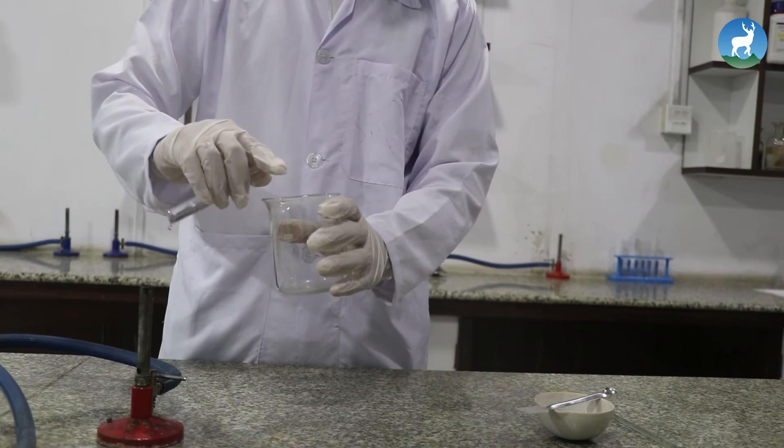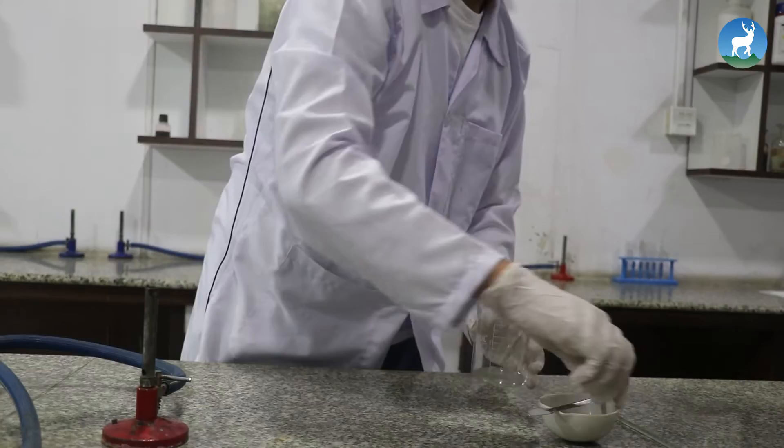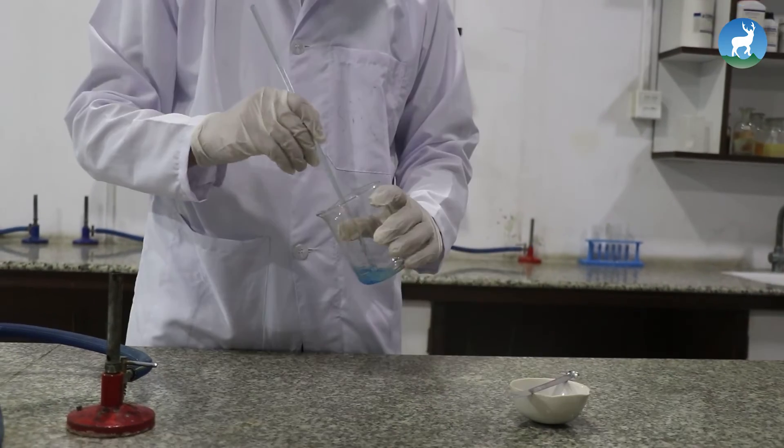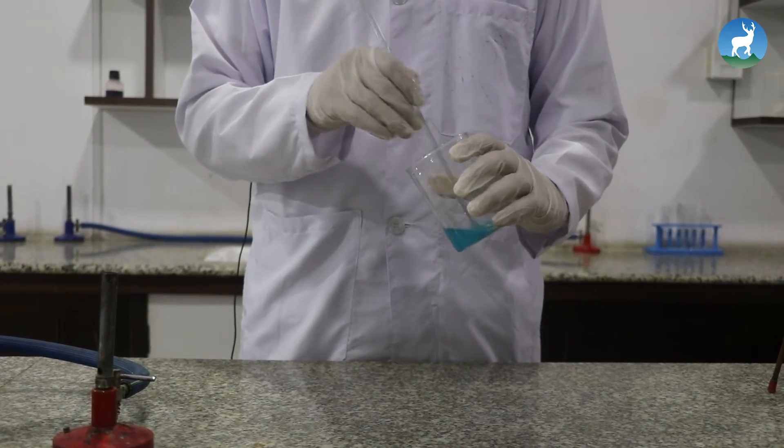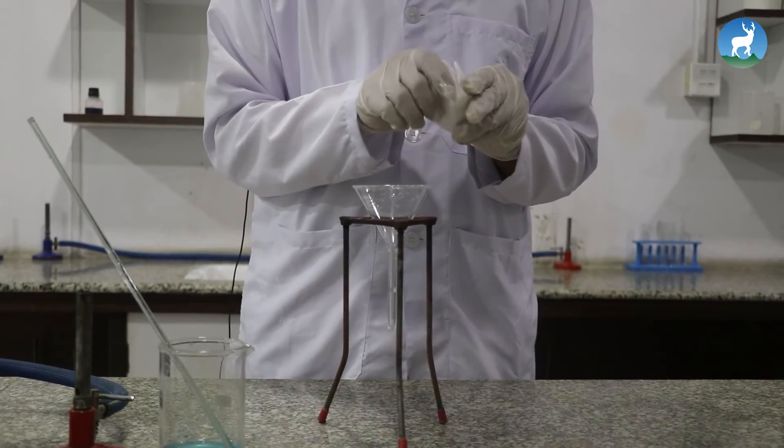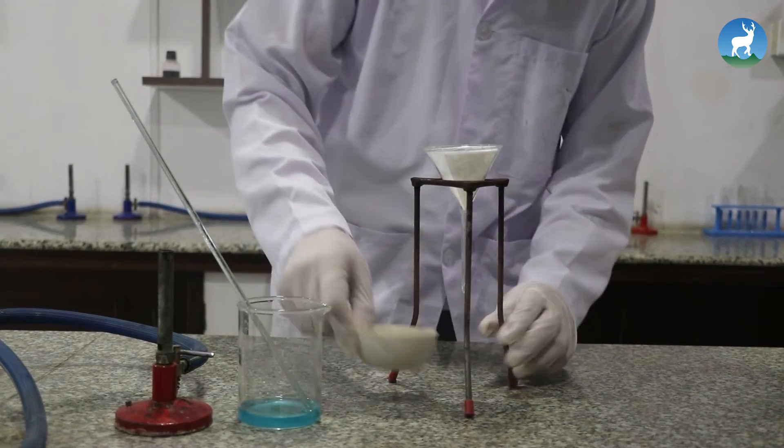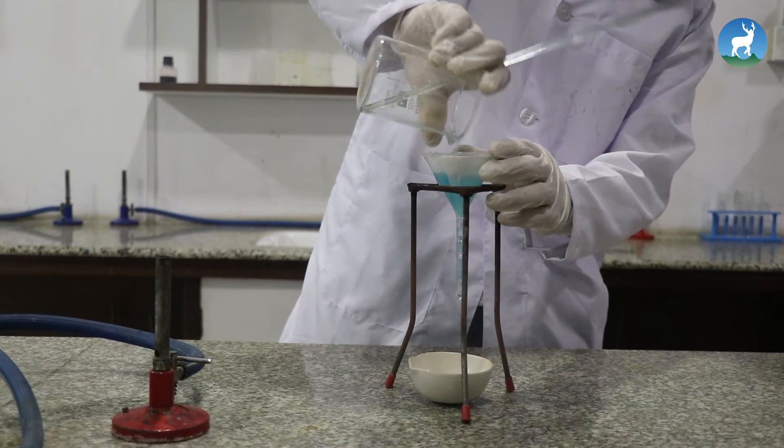Put about half test tube full of water in a beaker. Add small quantity of impure copper sulfate and stir it. Repeat adding copper sulfate and stir it to form a saturated solution. Filter out the solution and collect the filtrate in a dry porcelain basin.